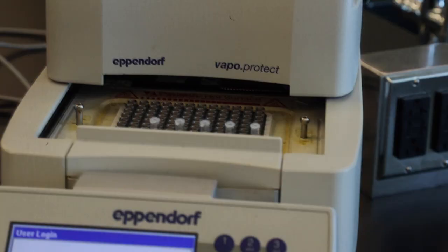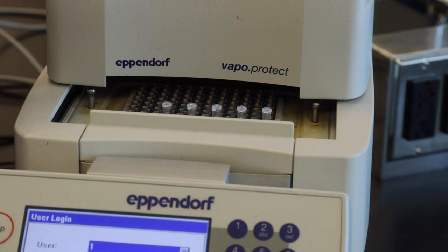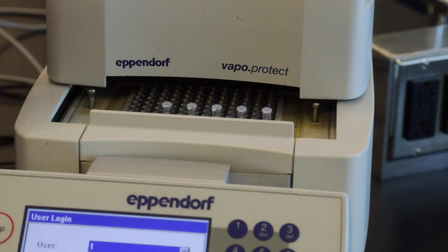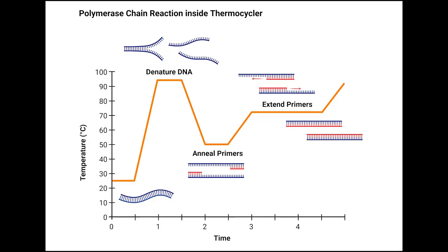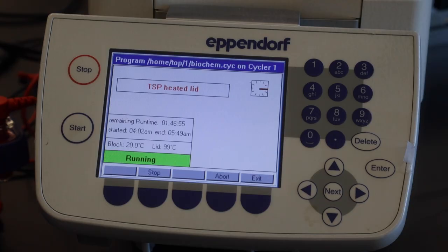Now that we've loaded our PCR tubes, we're going to select our cycle and let's start. What's happening inside the thermocycler is that it's adjusting the temperature. It first raises the temperature to denature the DNA, then lowers the temperature to anneal the primers, and then increases the temperature to allow the DNA polymerase to extend the primers.